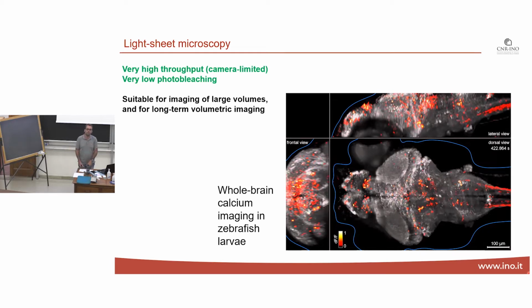But I think there are also requirements by the law that don't allow you to make experiments after a certain amount of days after the conception. But at 2, 3, 5 days, the nervous system is already developed, and you can actually see it. And you can do fluorescence measurement on functional imaging. So you can actually see what areas of the brain activate when the larva is subject to stimuli such as a sudden flash of light or things like that. This also we do, not me personally, but there is a subgroup in our lab doing this.